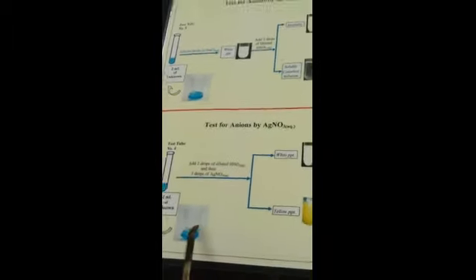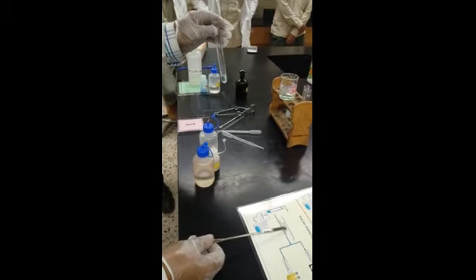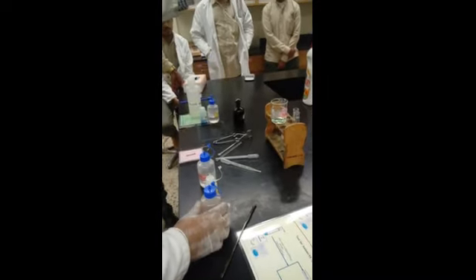Okay, let me try. Take 2 milliliter unknown sample to a test tube. And then read what they say. Add few drops of nitric acid, HNO3. I am adding few drops, 1, 2, 3, 4, 5. Nothing will happen hopefully. It is the same.